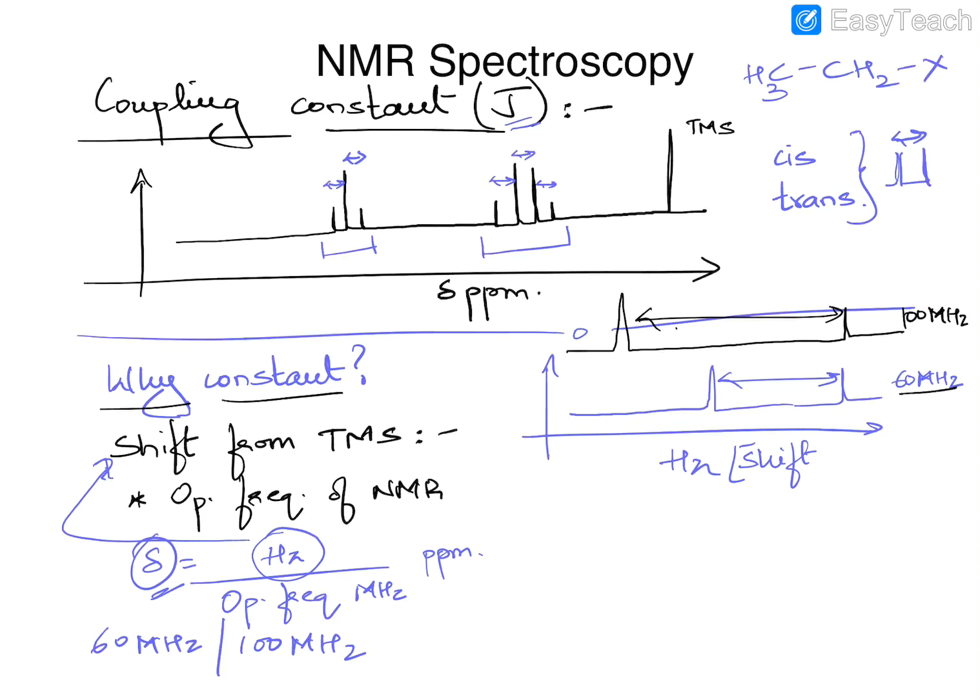So what I'm trying to establish here is that shift from a certain reference like TMS is dependent on operational frequency. That being established, let's look at what happens to these split signals.